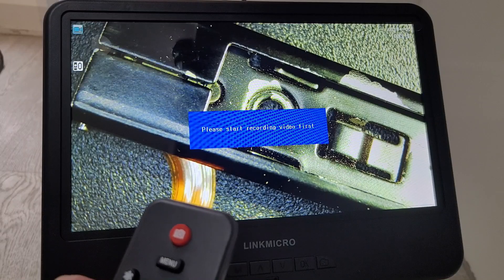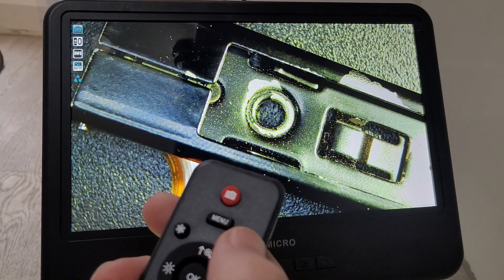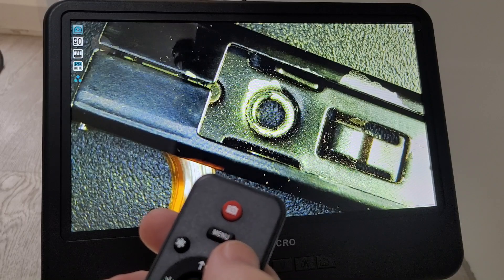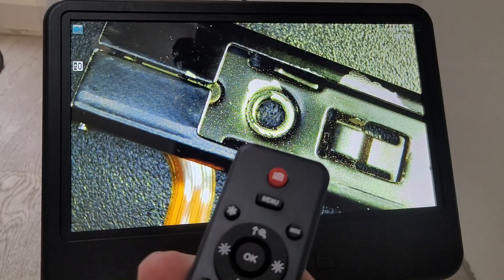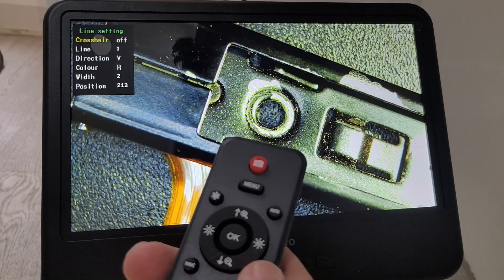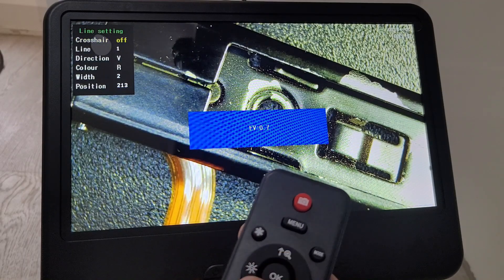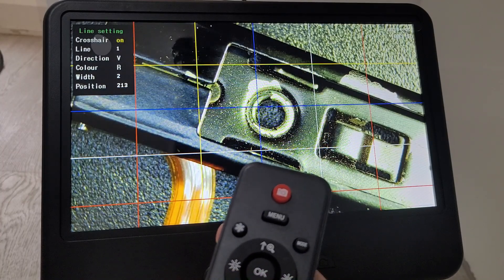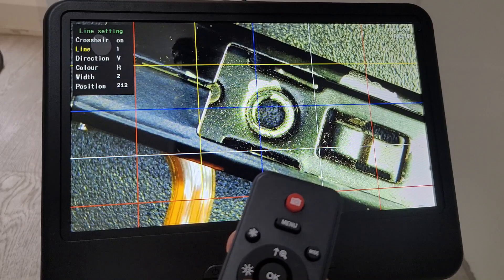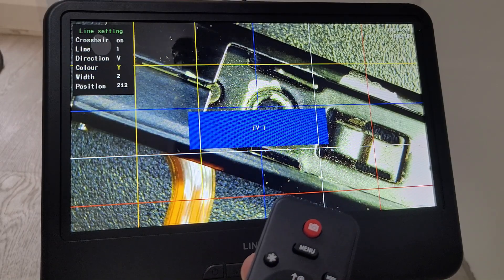All the features on the menu are also on the remote control, so you can use either. There's also a button just below the circle pad that brings up a couple of extra features. The grid is really good when you want to frame your picture — you can see where the center and edges are, so you know your main subject is completely central.